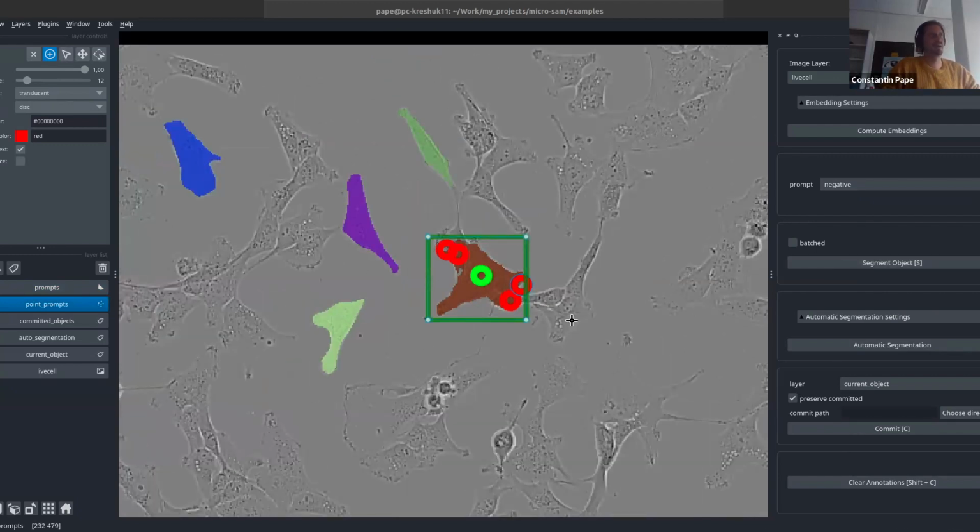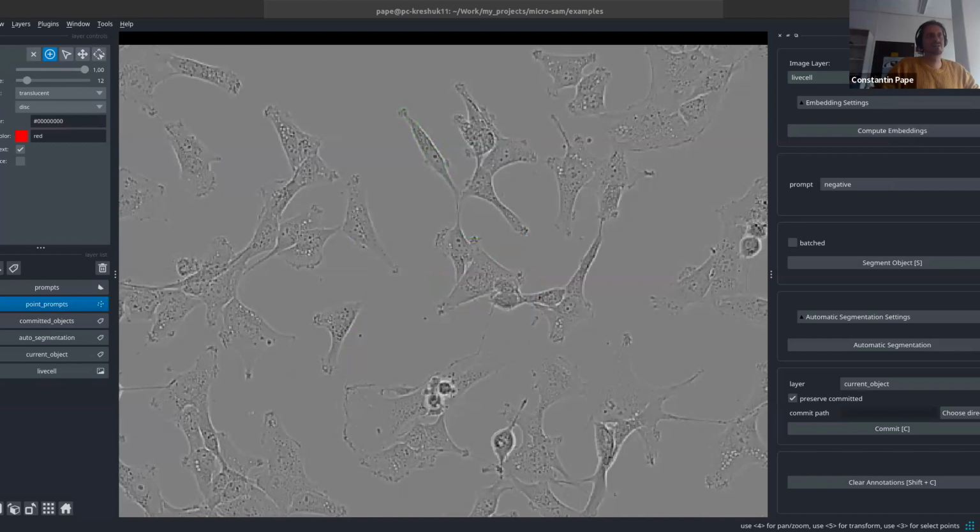So this is now the shortcoming of the default model that just wasn't really trained on microscopy data, so it does a fairly poor job when the segmentation problem becomes too difficult. That's why now we switch to our fine-tuned model. For this, we recompute these embeddings, and it also clears the rest of the state. When this is done, this again takes a couple of seconds. You see it working down here. Usually this is faster, but Zoom is quite CPU hungry.